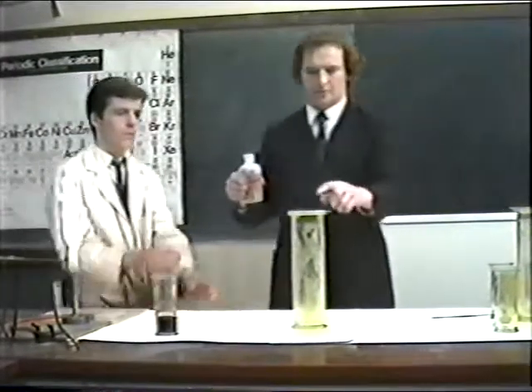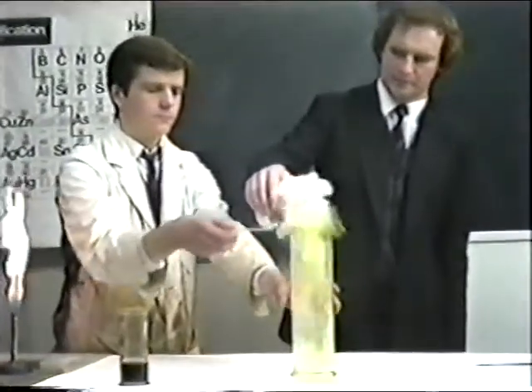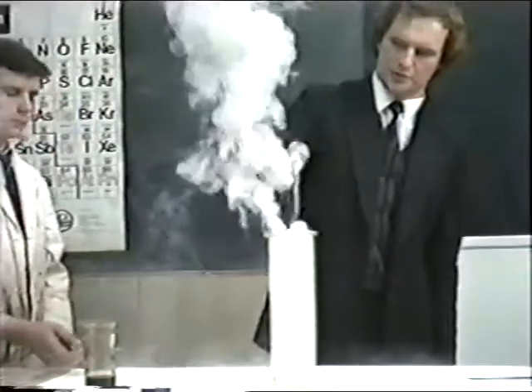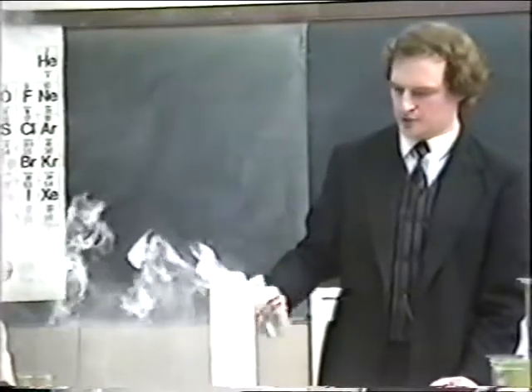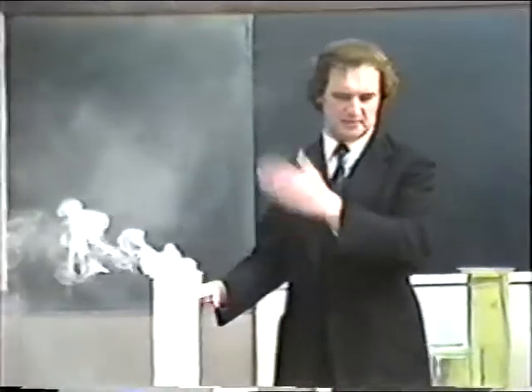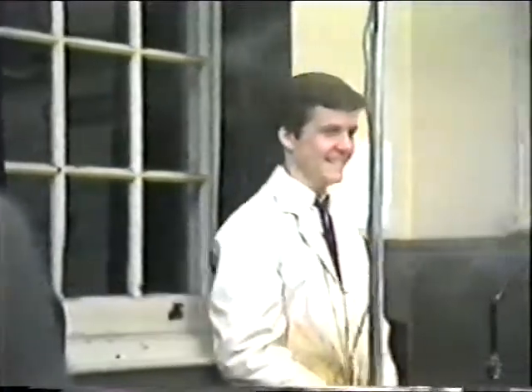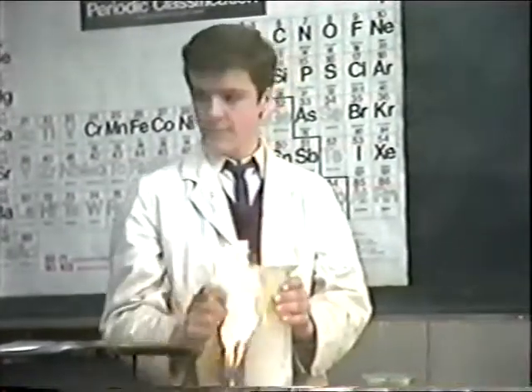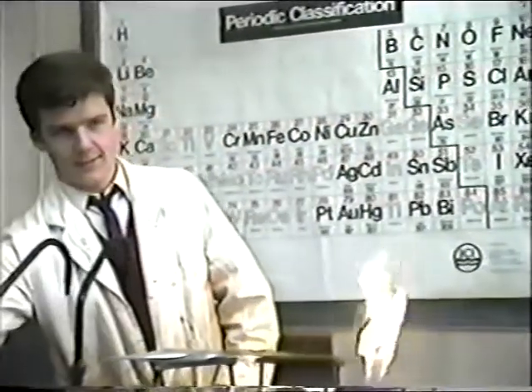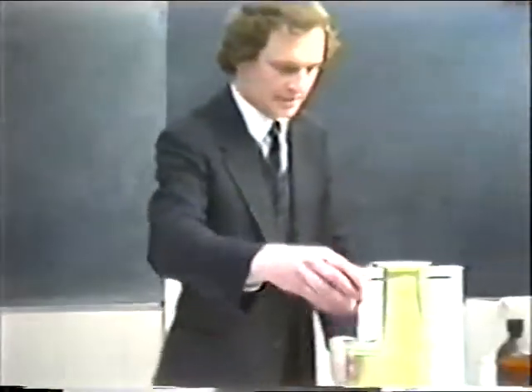If I can, Grant, could you remove the lid for me? As I pour the ammonia in, take it right off. There you notice a violent reaction taking place, and the white smoke which you see is a smoke which is due to, oof, dear me, as I said, ammonia is very, very unpleasant. I've just had a small breath of it. Nevertheless, we shall continue. The dense white smoke which is formed here is a smoke of ammonium chloride, which fortunately is relatively harmless. So there we had another example of combining two very poisonous substances to make one which is relatively harmless.